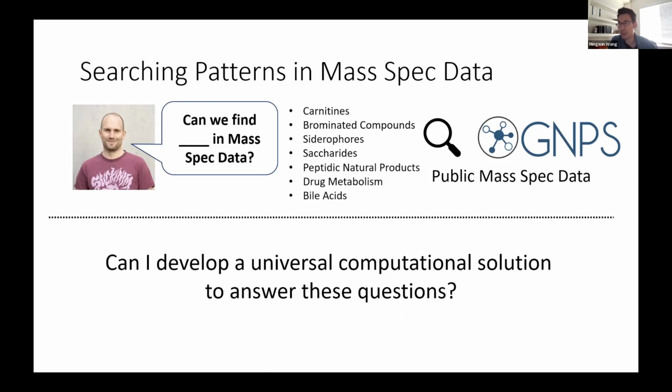And the nice thing about some of these classes of compounds is that the fragmentation is sort of known, right? The mechanisms of fragmentation are known in tandem mass spectrometry. And all that knowledge can be in literature as well as just in your heads. Analytical chemists, mass spectrometrists, you have that kind of model of what will happen when you put a compound into a mass spectrometer in your head. But for every class or subclass, I was not going to code a separate piece of software for everybody. Number one, because I'm lazy.